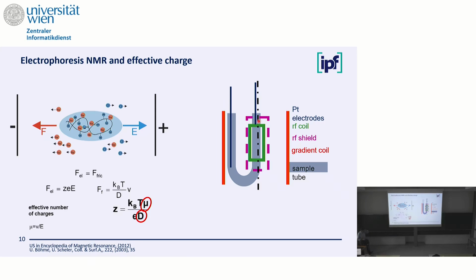The charge that we get: I only have to measure in two separate experiments the electrophoretic mobility and the diffusion coefficient. Some arguments, some questions: I measure them on the same time and length scale.